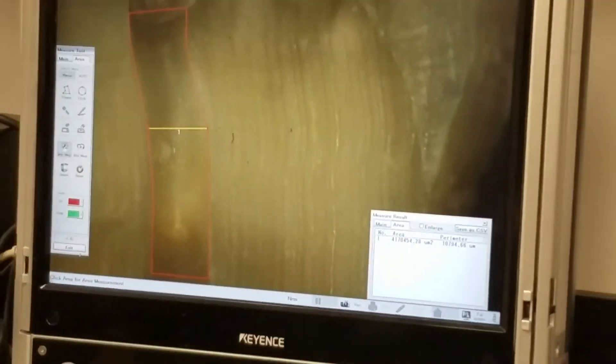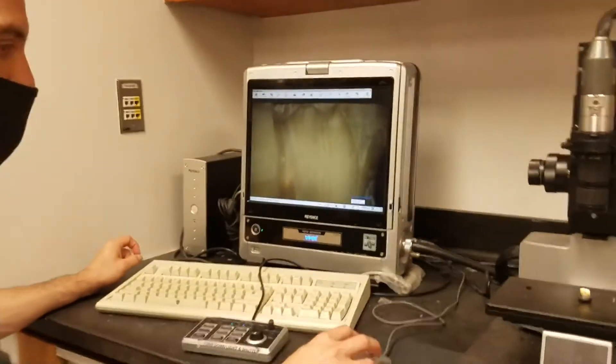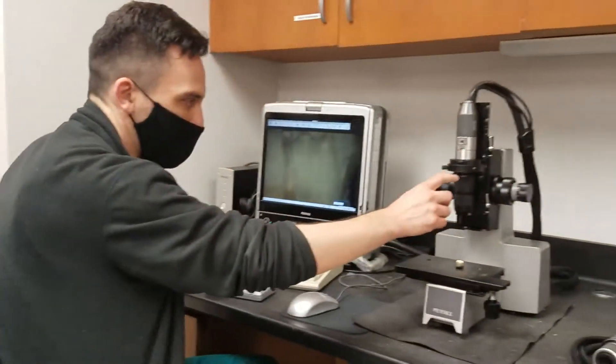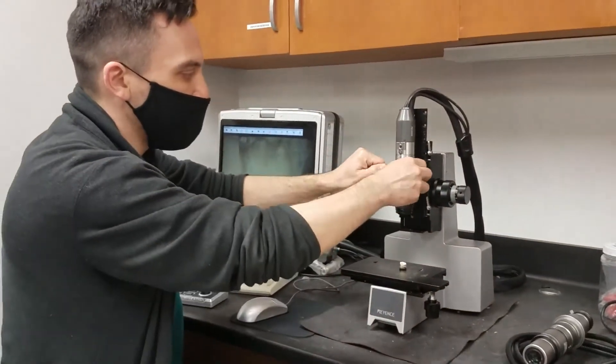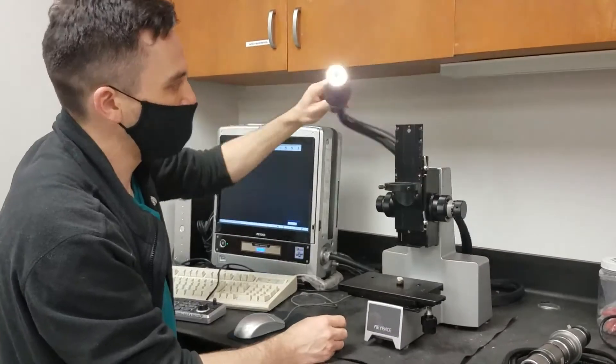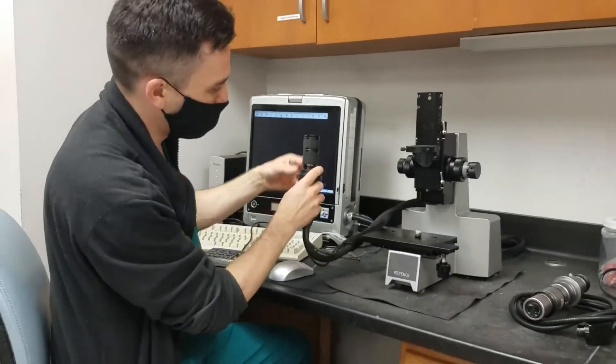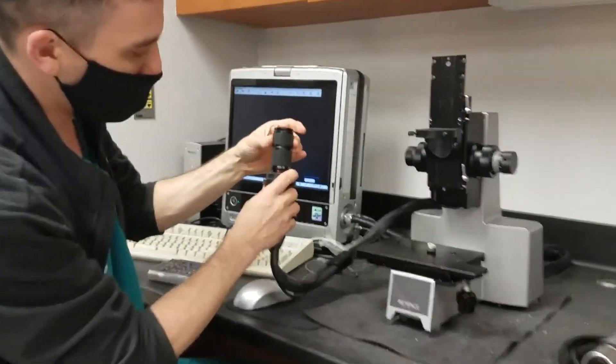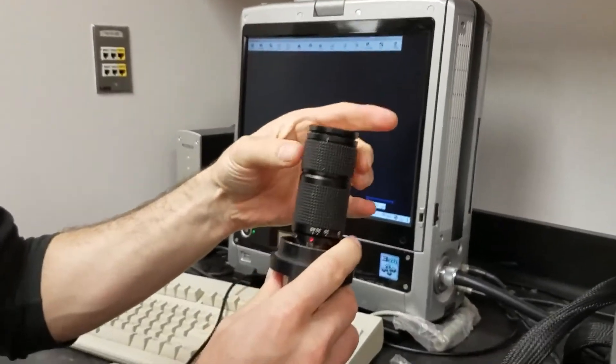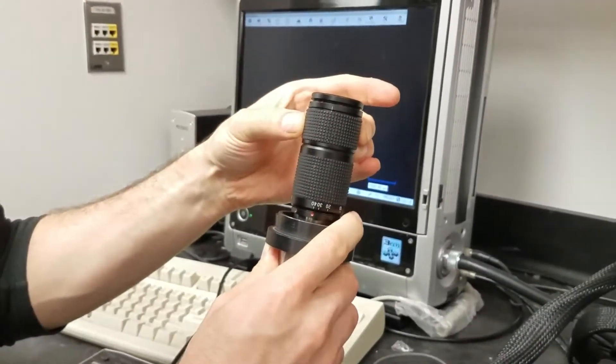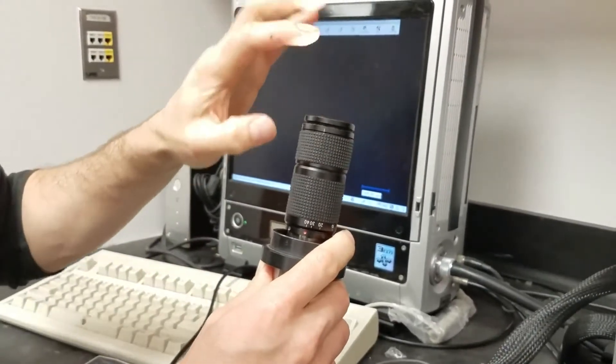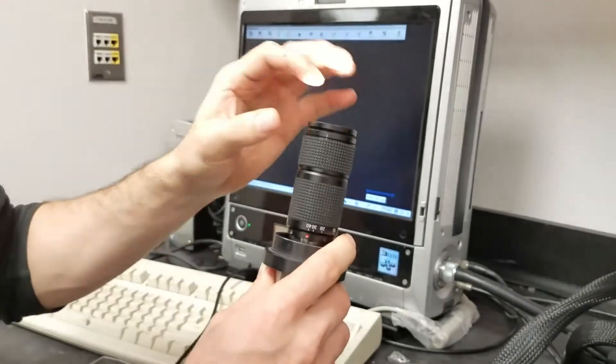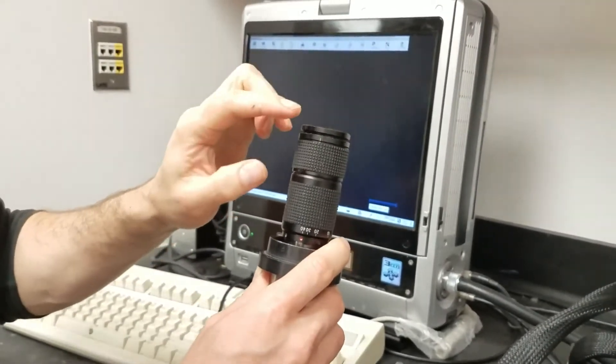So you can do all this kind of stuff. Again, remember before you do that you have to make sure that you select the right lens size. And then also, you want to make sure that down on this bottom here, there's this second knob which you really shouldn't turn. You have to make sure that that's lined up. That should never be not lined up because that will mess up your measurements.